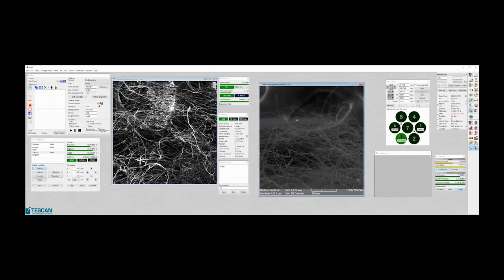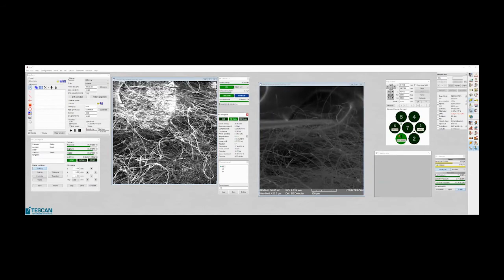Okay, you can see that we are coming with the tip closer and closer by focusing it. So it's here. By FIB, it's not here yet. Maybe a bit, because we have some movement. So we were probably touching.